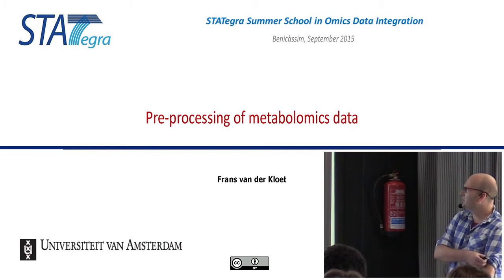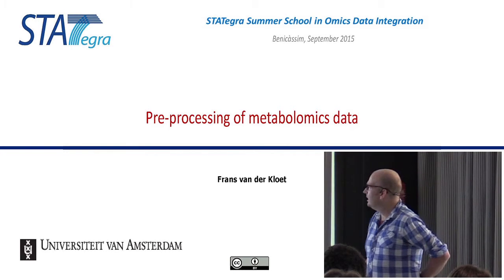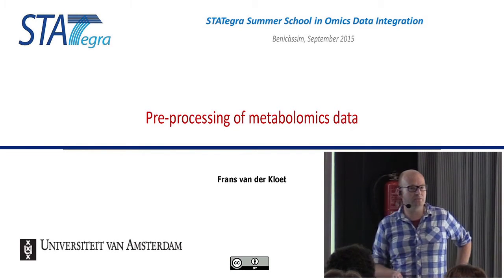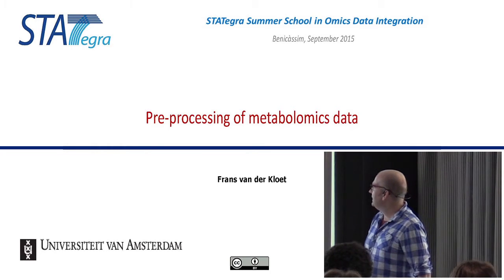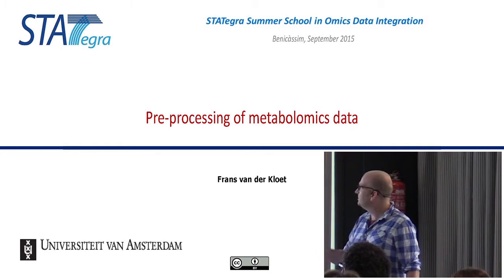I'm going to talk a bit about the metabolomics data, and specifically how to pre-process the metabolomics data, because it's not easy to get hold of it. Well, it's easier to get hold of it than to process it. And I want to discuss a couple of issues with you that you can come across if you handle metabolomics data.